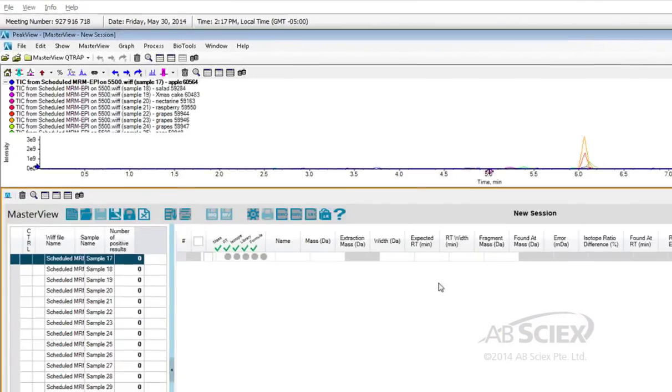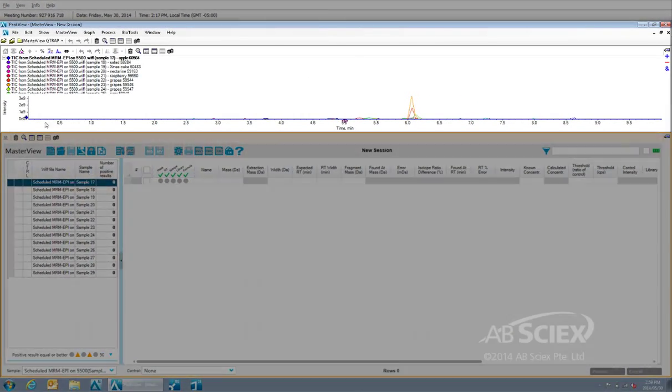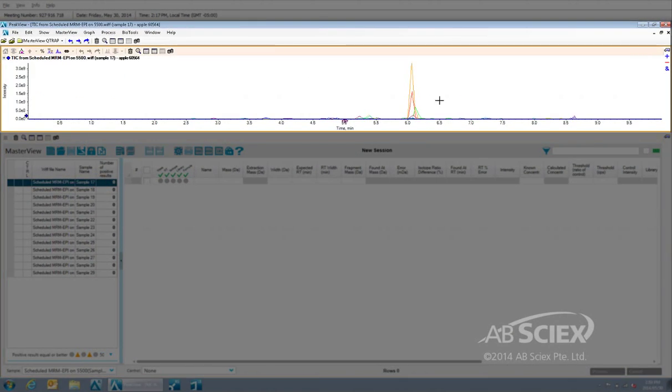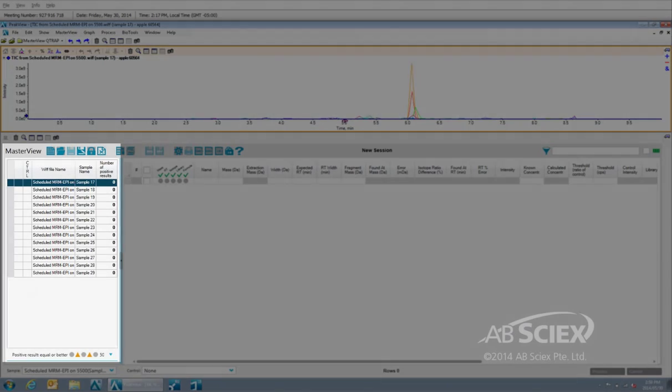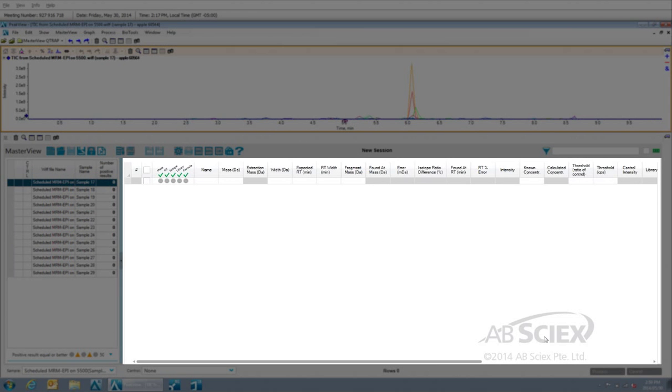Once opened, the total ion chromatograms for these samples will appear in the top panel, a summary list of the samples will appear on the left side panel, and our data processing table in the center.